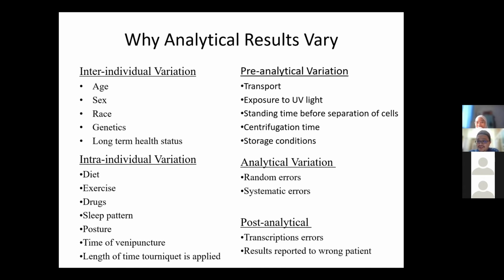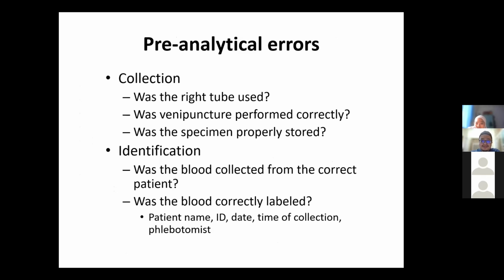Tapi kalau dekat UK, A. Smith, Alexander Smith, ramai Alexander Smith. Ya? Ramai Alexander Smith. Christopher Green, punya ramai Christopher Green. So there is a higher chance for them to make error. Christopher Green yang mana ni? Macam tu. Okay, now pre-analytical errors.